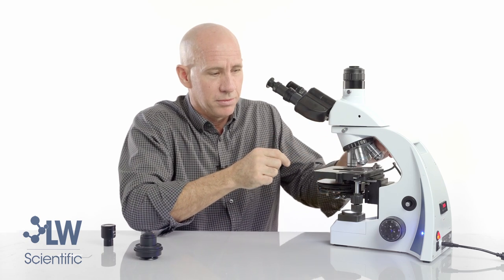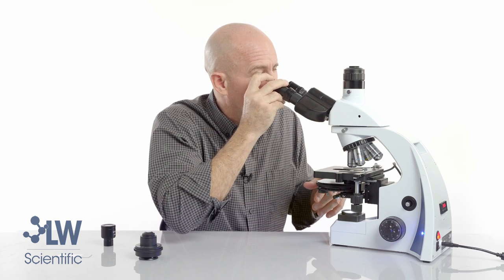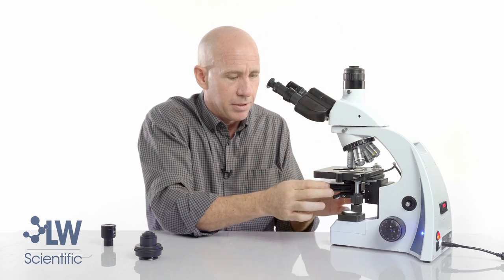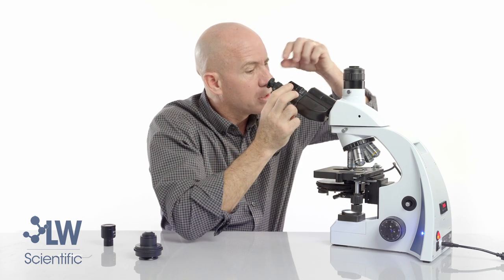With the same position on the wheel, the 20x is going to be perfect as well — you might have to refocus a little bit, but it's perfect because they share the same ring. Now let's go to the 40x and spin the wheel. Refocus again — it's very close, just a tiny adjustment.